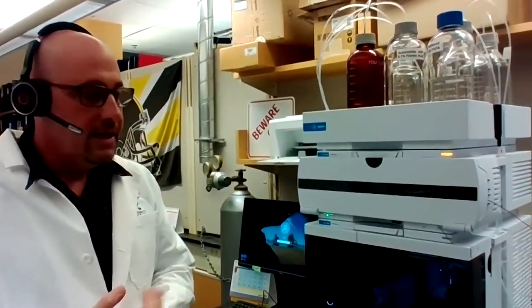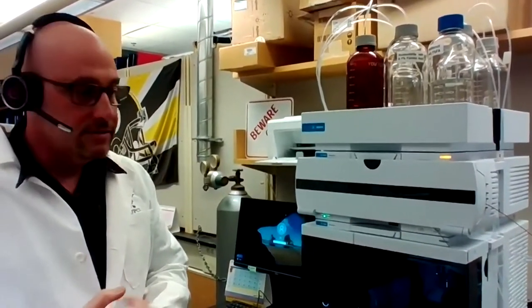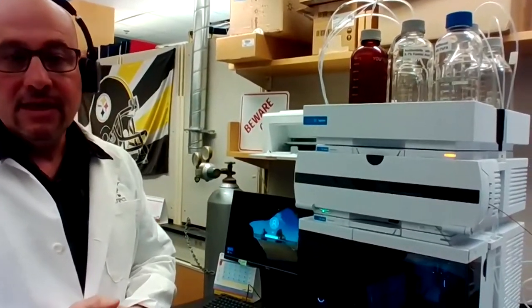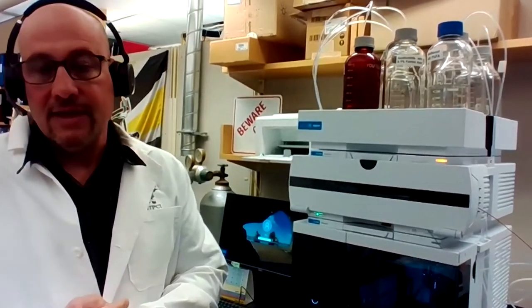Hello, my name is Bob Parise, and today I'm going to give you a quick introduction to LC mass spectrometry, explain a little bit about the equipment, run some compounds through here. We're going to talk about sample preparation, and then at the end, we'll go through some data and do some data analysis.